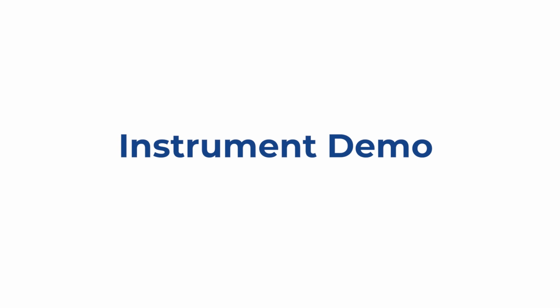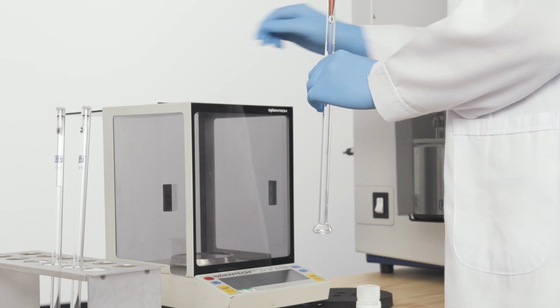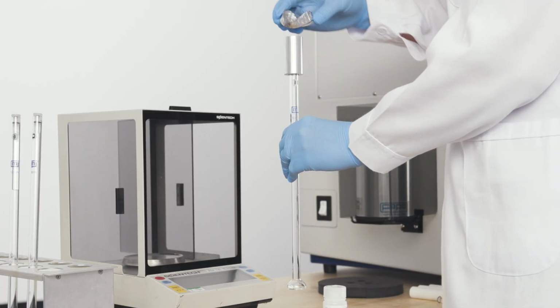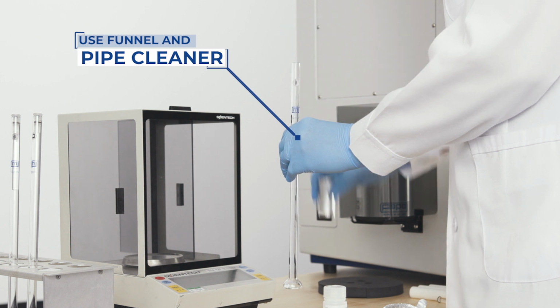Now that we have discussed some of the advantages of the 3Flex, we will talk about how to load and run a sample. For this demo, we will be conducting a nitrogen physisorption experiment. First, take an empty sample tube and weigh it, recording the empty sample tube mass. Next, load the sample into the sample tube using a funnel if necessary for powdered materials.